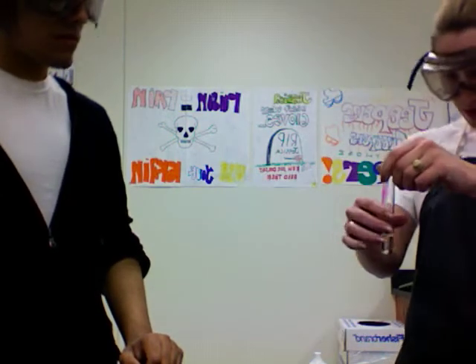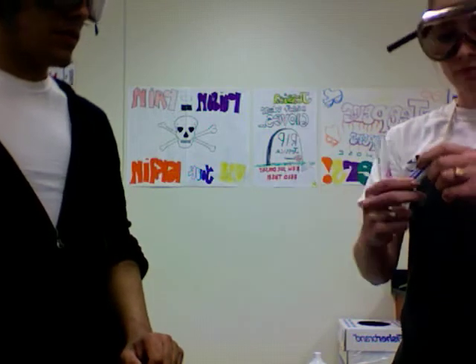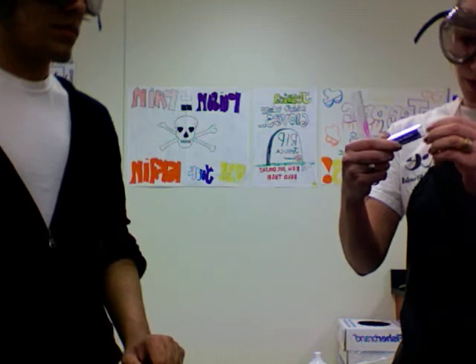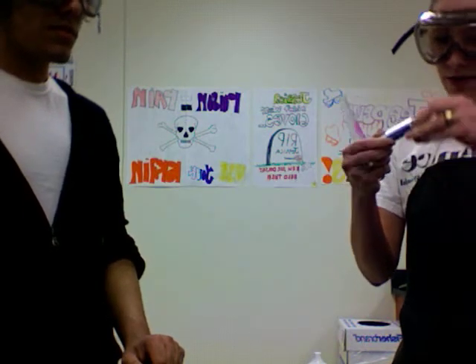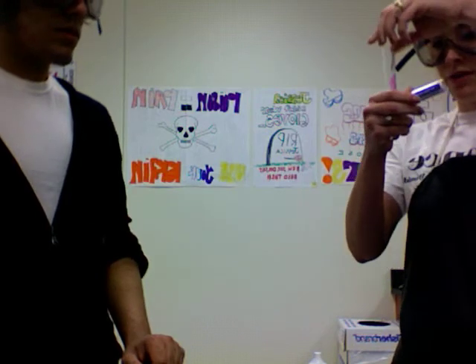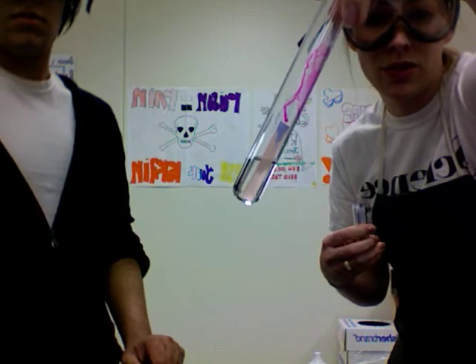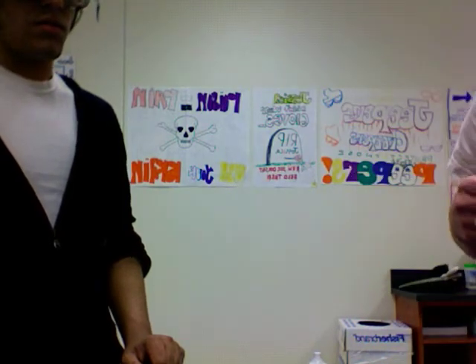Whenever you're dealing with acids or bases, you want to double check to see if it is safe to pour down the sink — if we have truly neutralized it. So I'm going to put a blue litmus paper in there, and it turns pink, which means it is not safe to dump down the sink without first neutralizing. So we'll put this in our special dump container.